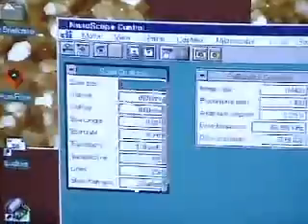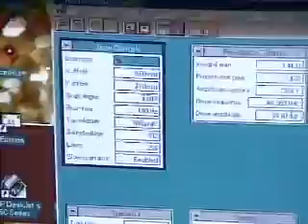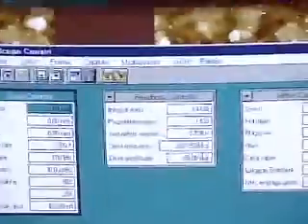So I type in 1 and enter, and this is changed to 1 hertz, and then I go up here on the scan size, click on that. This is now in nanometers, but I want microns, so I type 5U. The U stands for microns, and then hit enter, and now it changes to 5 microns. And if we look back over here, you can see that it's picking up a lot of structure here.